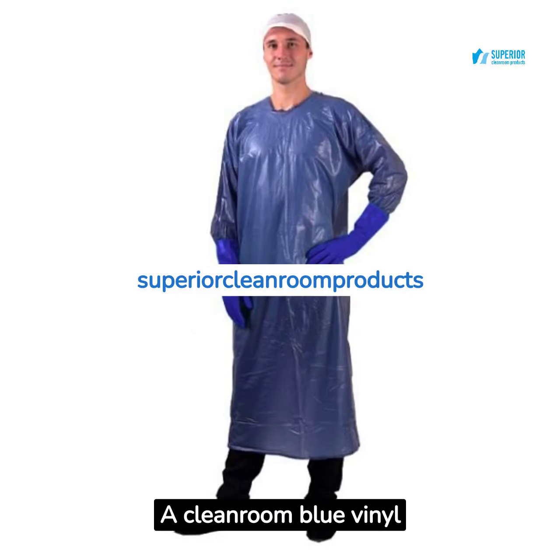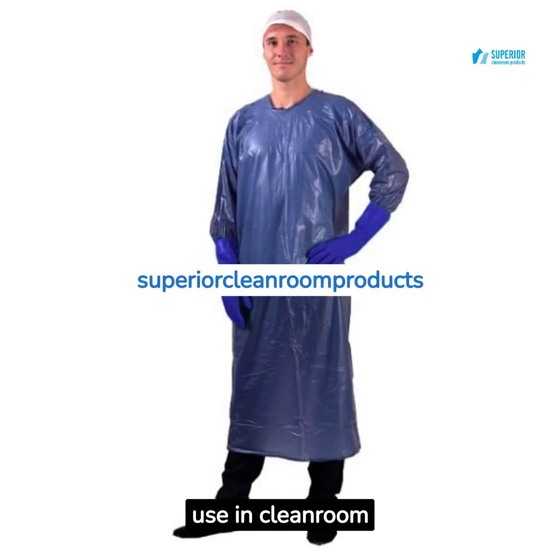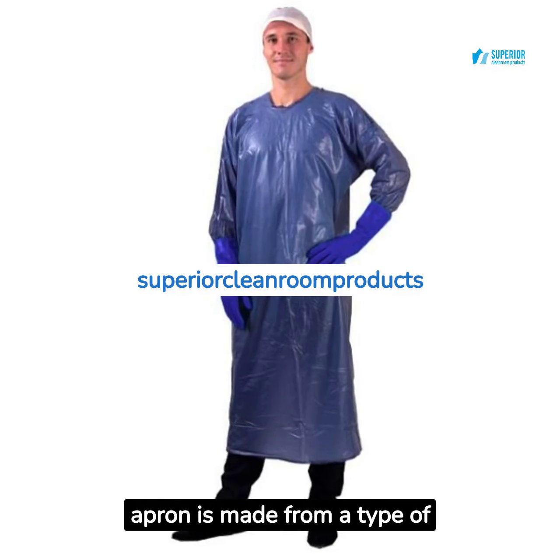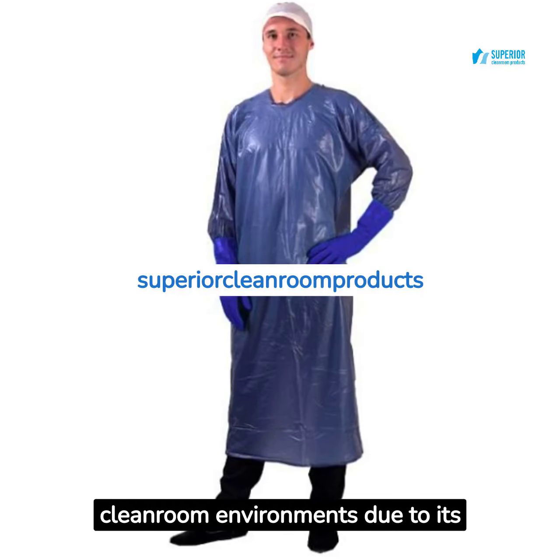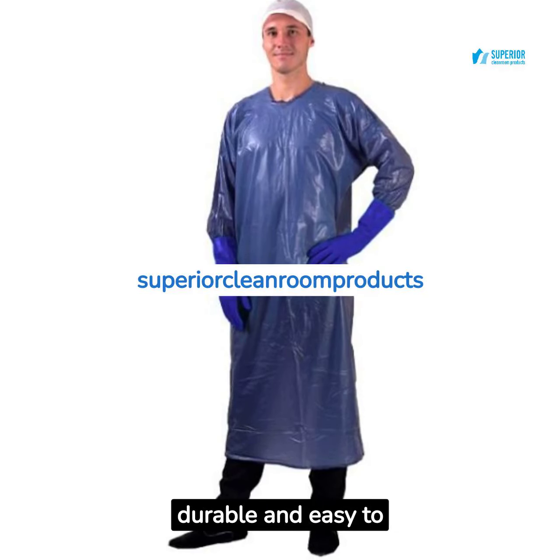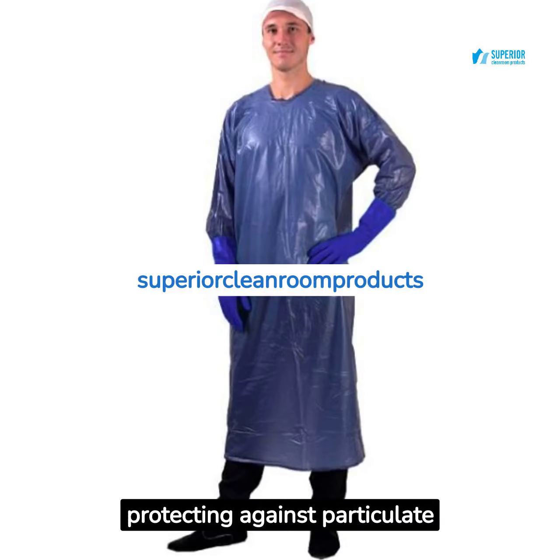A cleanroom blue vinyl coat apron is likely a type of protective garment designed for use in cleanroom environments. The use of vinyl suggests that the apron is made from a type of synthetic polymer material known as vinyl. Vinyl is often used in cleanroom environments due to its low particle shedding characteristics. It's durable and easy to clean, making it suitable for protecting against particulate contamination.